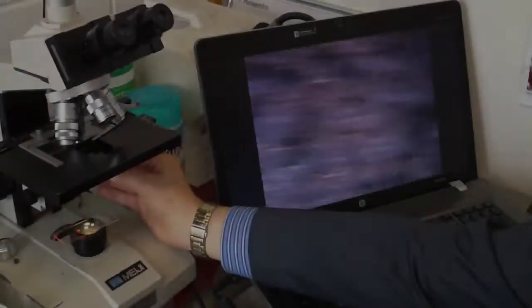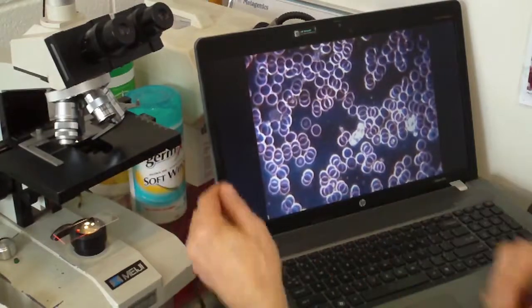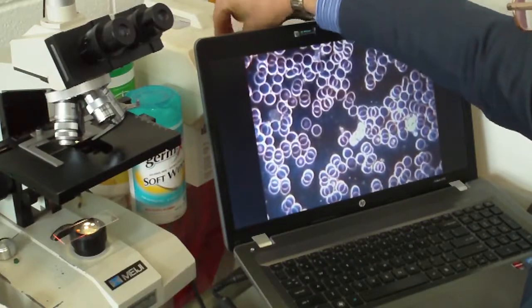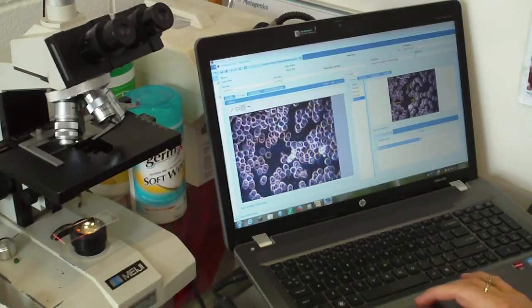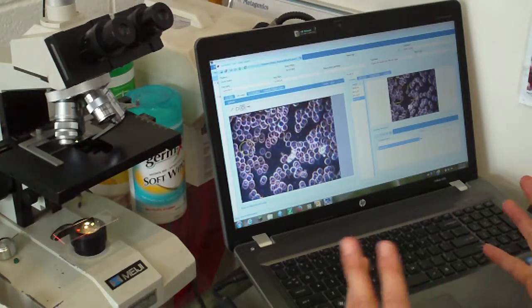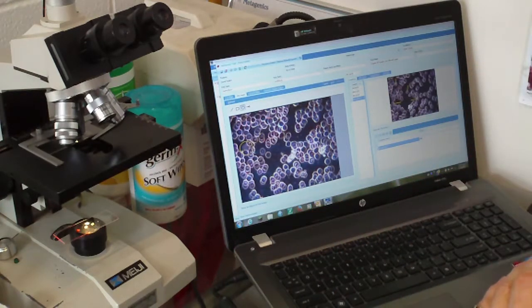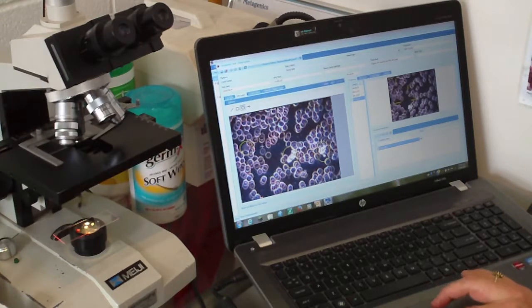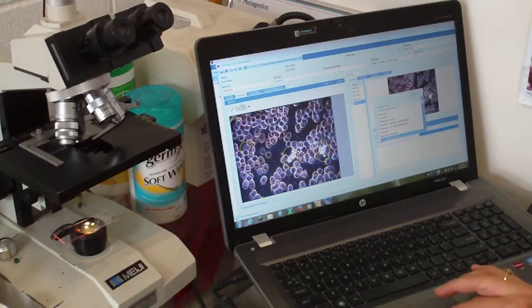So moving on, have a look around the blood. So now here we go, we can see another couple of types of blood cells. Now, this is where it gets a bit more interesting. As I said before, there are five types of white blood cells. We can see two types in this screen here, and I'll show you them. So this one here, which is very faint, is a lymphocyte. Lymphocytes are like vacuum cleaners for viruses. Their job is to go around the blood sucking up dead viruses, or live ones for that matter. These ones here are the neutrophils we mentioned before, slightly distorted. So it is possible that the patient has had contact with a virus, a very mild one. The immune system is throwing it off. It's no big deal.